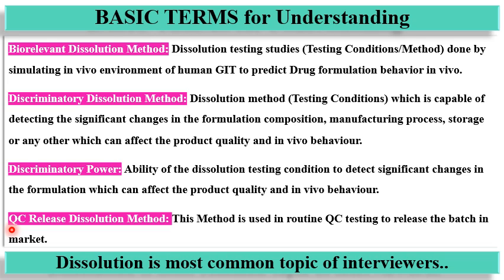Now, can your discriminatory dissolution method be a biorelevant method, or your biorelevant method be a discriminatory dissolution method, or a discriminatory dissolution method be a QC release method? The answer to this is yes. Some of the QC release methods may give good discrimination, and that is a requirement also.